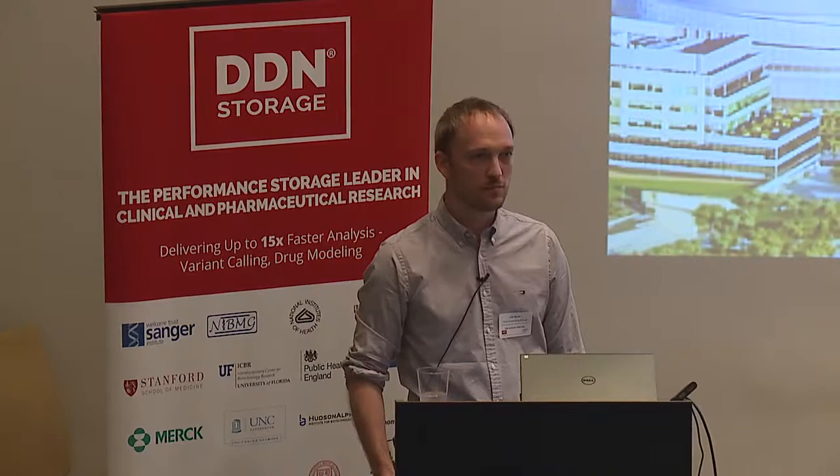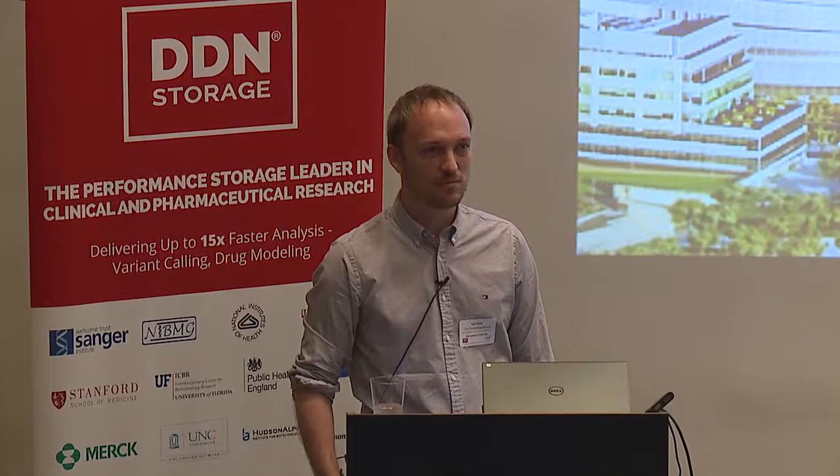Joel Zisman, Director of Advanced Computing for University of Miami. You mentioned the size of the data exploding when you ran your convolutional neural networks on it. How much processing time did this take? Processing time for the Melanogaster deep learning network? Was it a significant amount of time? I think by now it should be possible to do that in real time. In real time with what kind of computational resources? You need the latest graphics card, and you need to slightly optimize the networks by using some tricks.